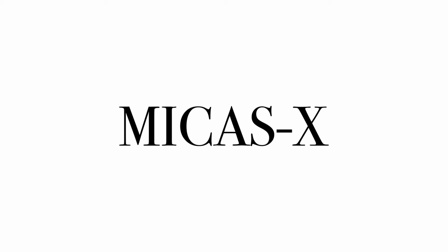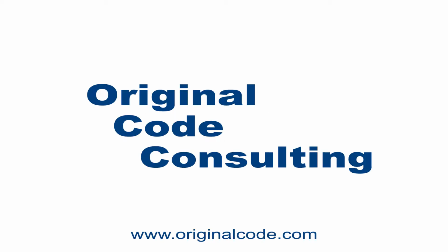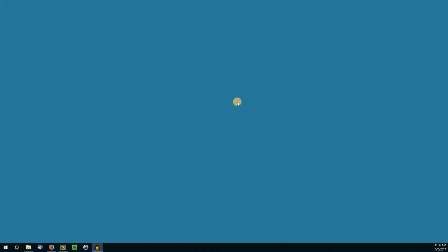This video demonstrates how to use MICAS X, the Multi-Instrument Control and Acquisition System extended from Original Code Consulting. In this demonstration, we are using a ramp demo configuration file with the Student Edition of MICAS X. Installing the Student Edition is simple.